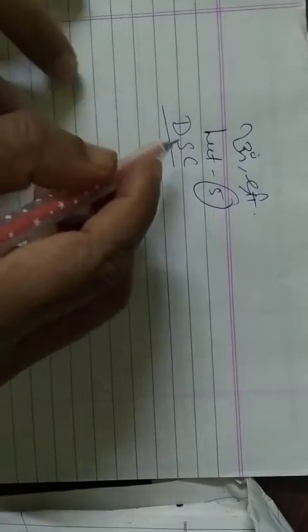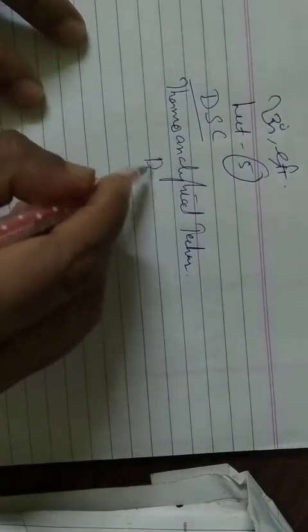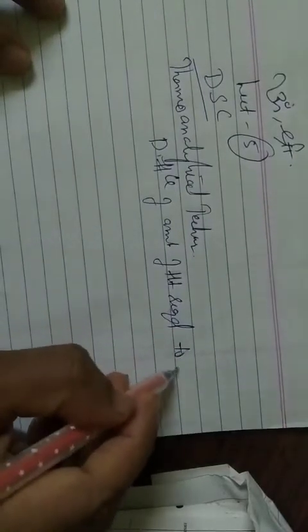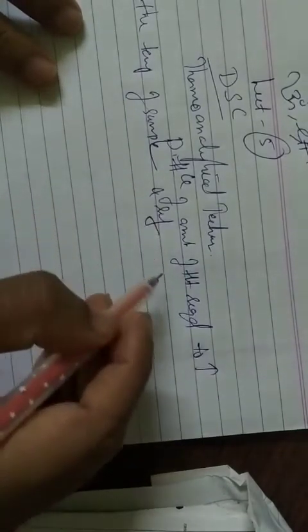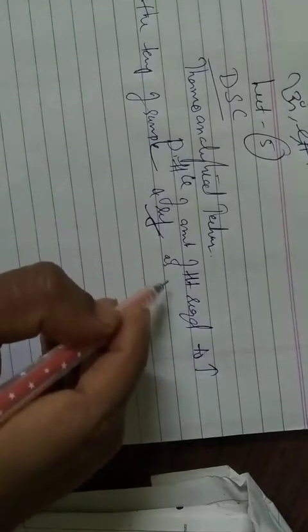This is a thermoanalytical technique in which we measure the difference in the amount of heat required to increase the temperature of the sample and the reference as a function of temperature.